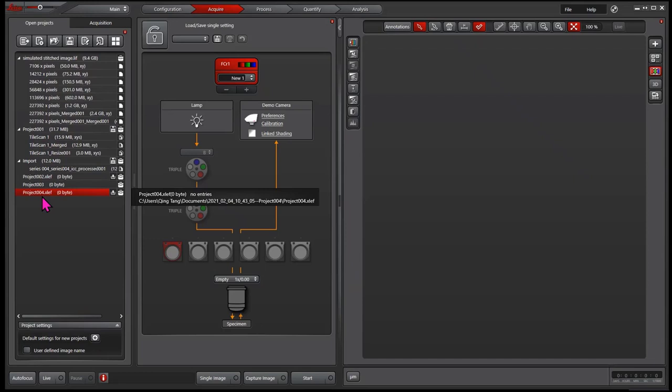From now on, you start to acquire the images. The images will be captured immediately in the hard drive as the format you choose, and the metadata saved along with it.